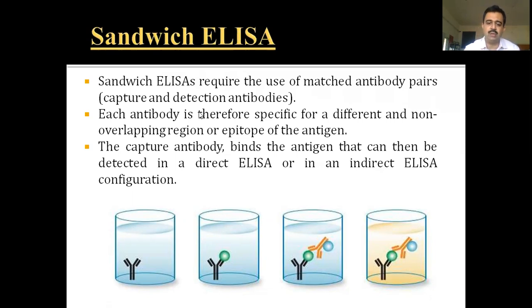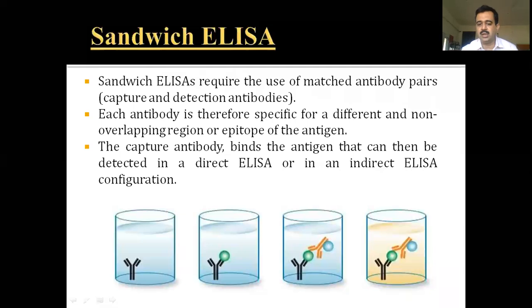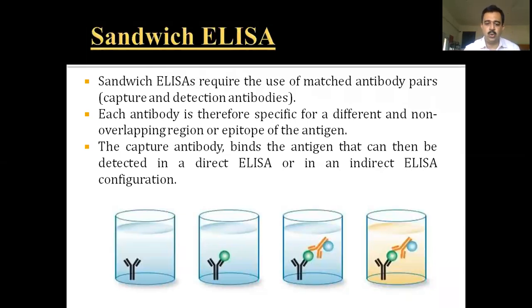So here, instead of an antigen this time, the antibody has been fixed. These antibodies can be taken from the blood of the particular patient. Once it has been centrifuged, the serum will contain the antibodies, and then these antibodies can be fixed inside the well. Once you pour the antigen, if it is a specific antigen, then it will bind to that antibody.